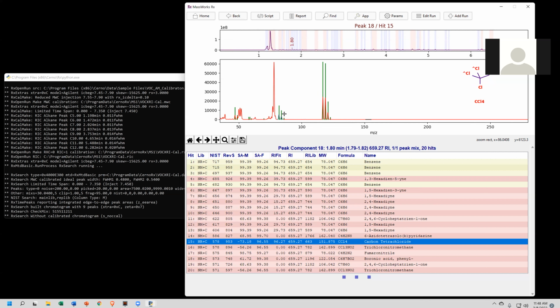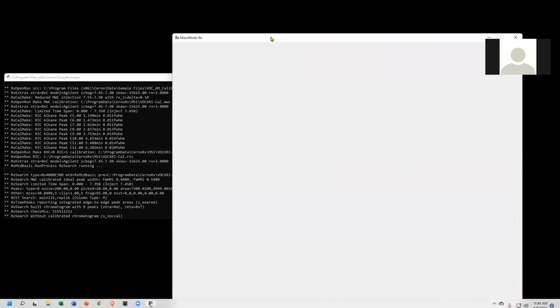So this is a very powerful tool, and you can actually figure out what is in mixtures without being able to deconvolve them. Because again, deconvolution does not always work. Okay. All right, so let's say that's great, but let's go back home again.